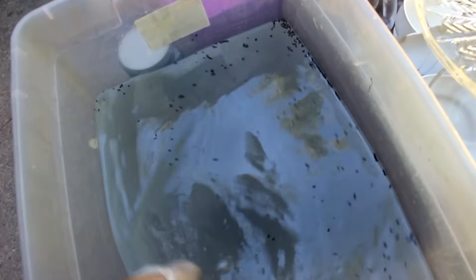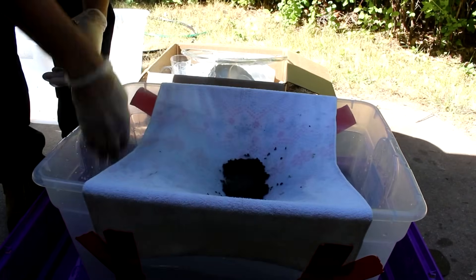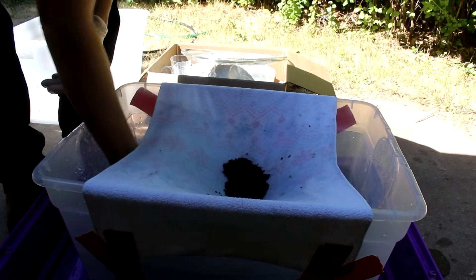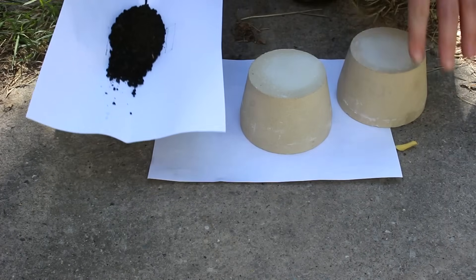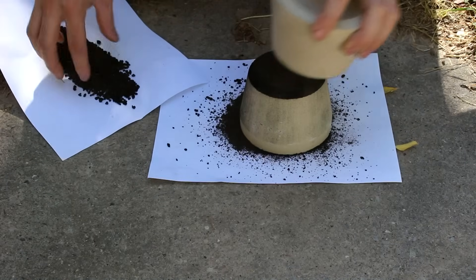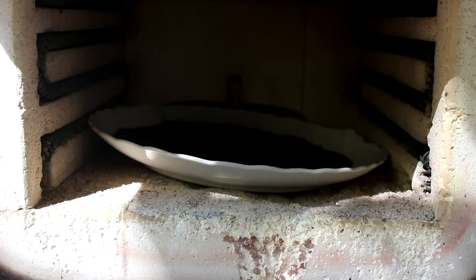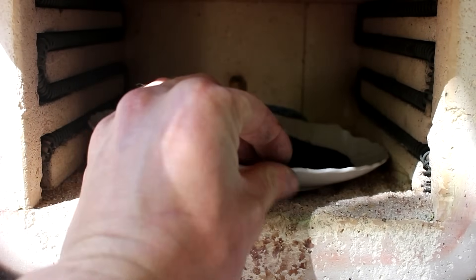I'm actually going to give this a stir every now and then, and let it absorb onto the carbon for a little bit longer. There's quite a bit of carbon down at the bottom — probably way more carbon than I needed, but I wanted to make sure I got all the gold. Before burning the charcoal to ash I'm actually going to grind it up into a fine powder so it'll burn quicker. So I'm just going to put the crushed carbon into the furnace on top of a plate — just like that. Now let it get red hot for several hours to burn away the carbon. We'll see what happens.